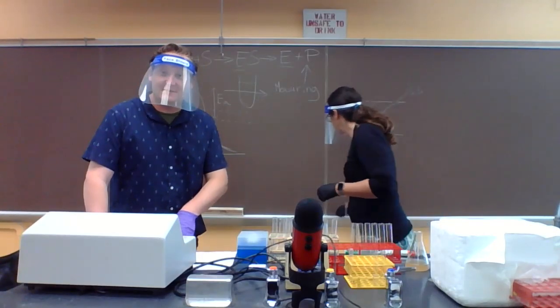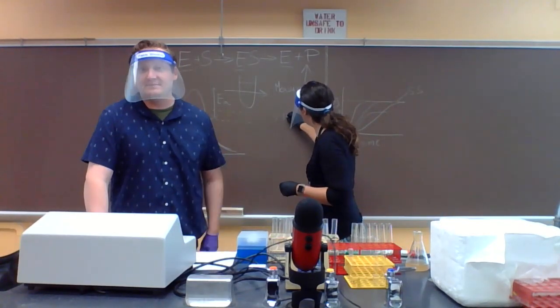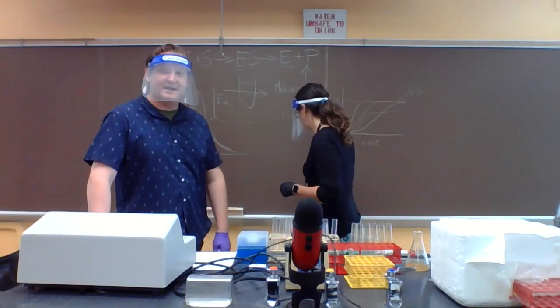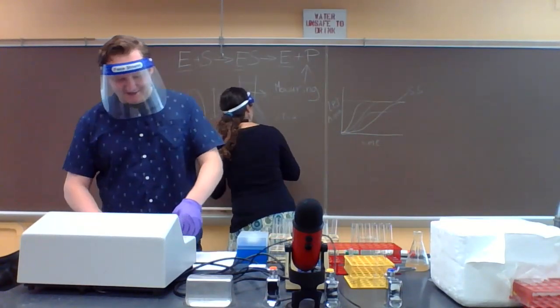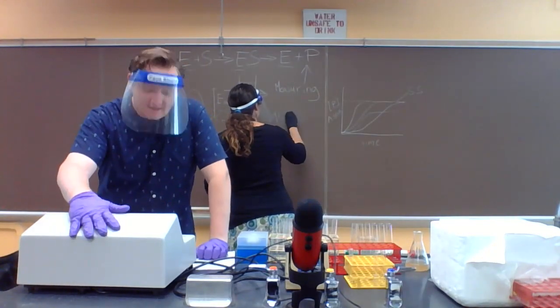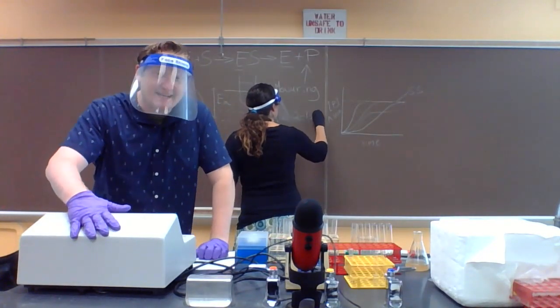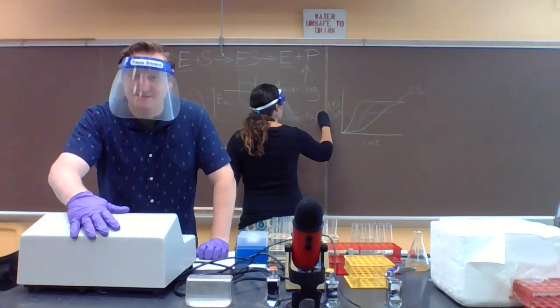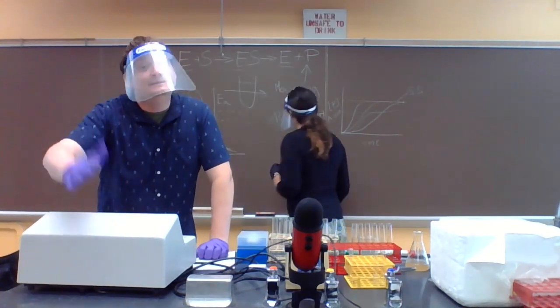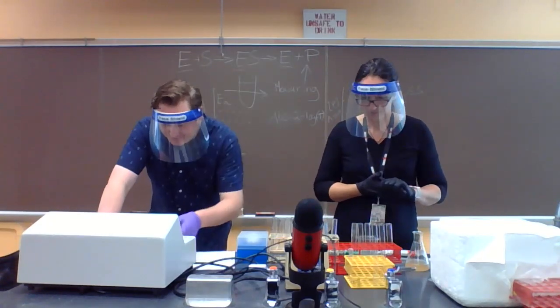Yep, we will post up the raw data as we've been doing, and you're responsible for completing basically the lab handout. As should be expected. Now, the Spec 20 does make a little bit of noise when it's actually kicked on, so please bear with us. I'm going to try to muffle or edit out that sound as best I can, but it might be a little annoying buzz in the background. All right, let's crank this thing on.